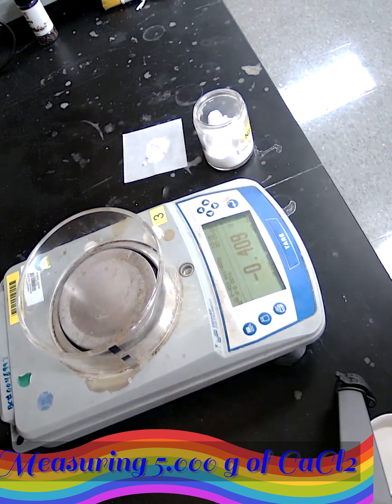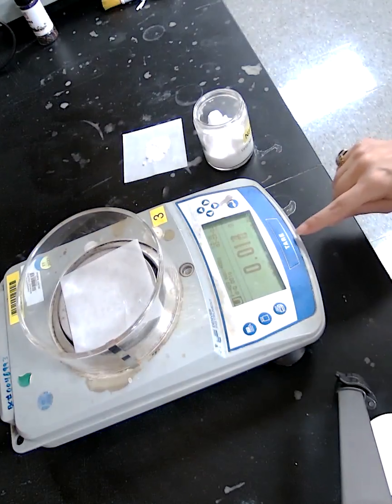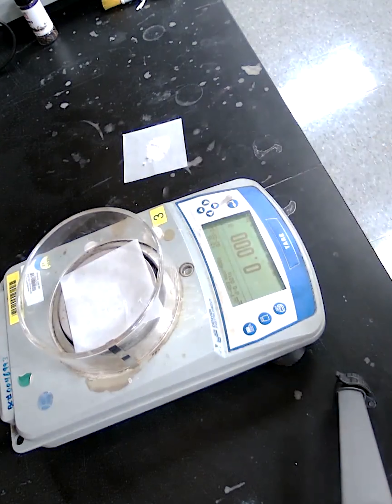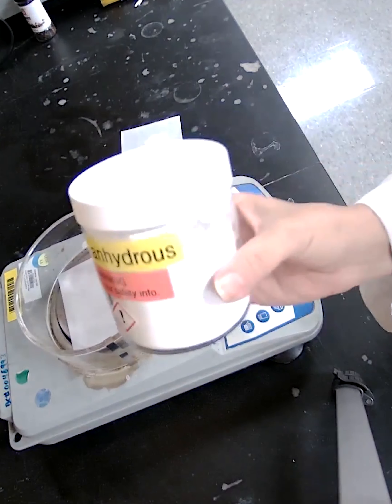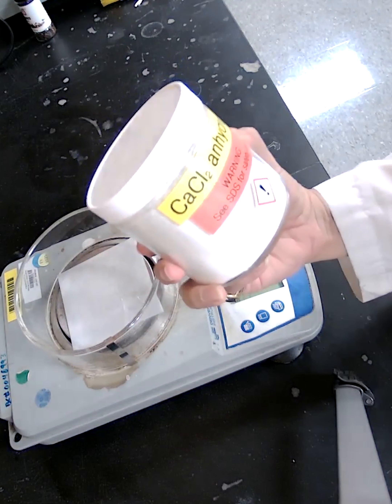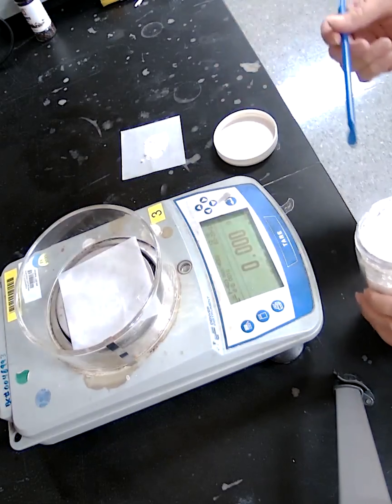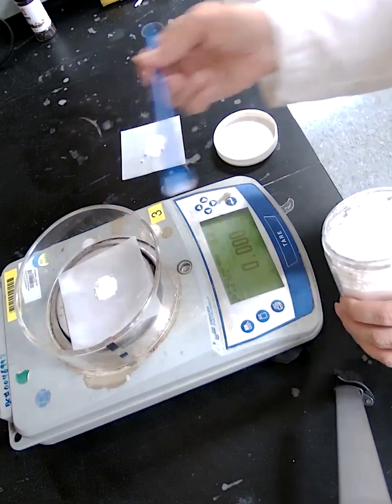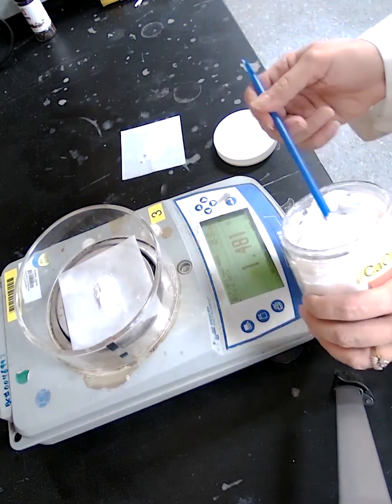Next, measure 5.00 grams of calcium chloride. Place a new weighing paper on the scale and press the tare button. Add the calcium chloride one spatula at a time to get close to 5 grams.